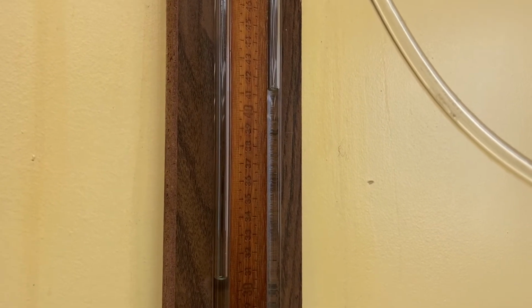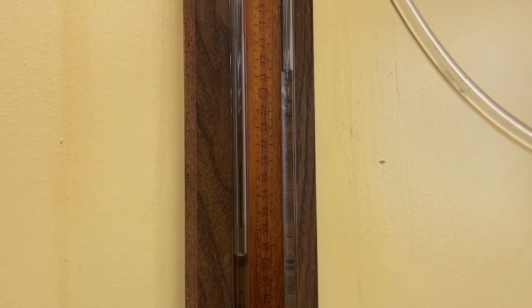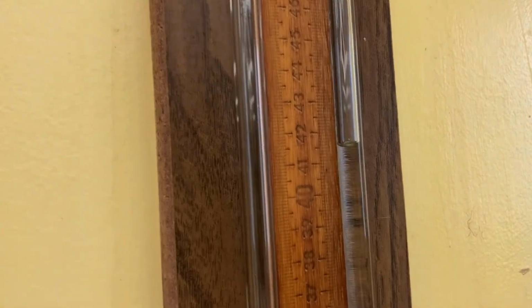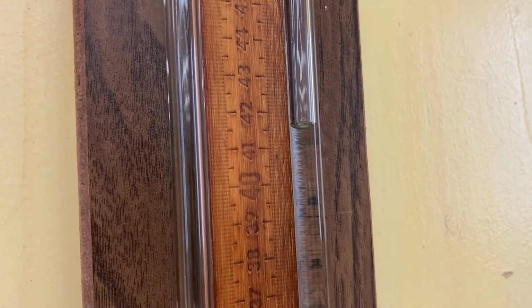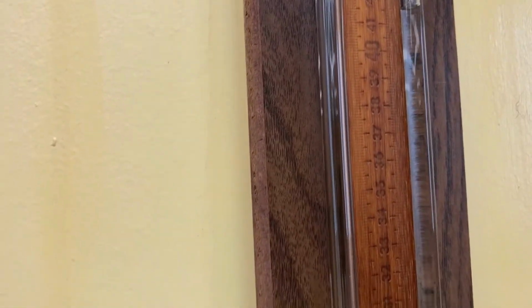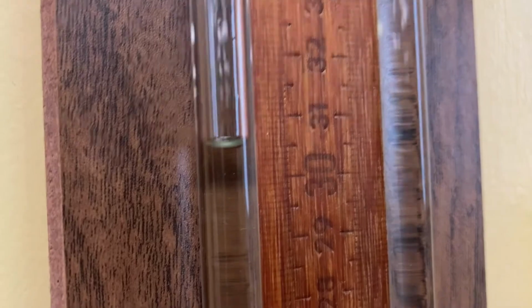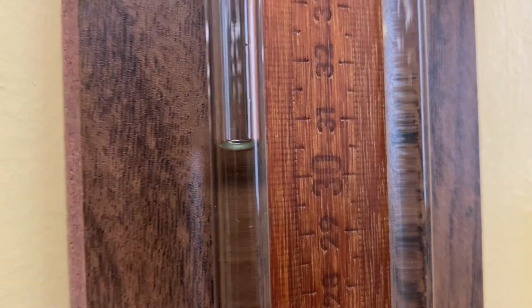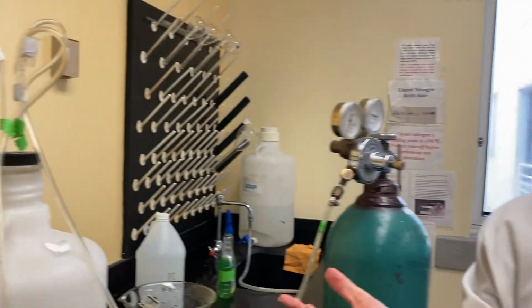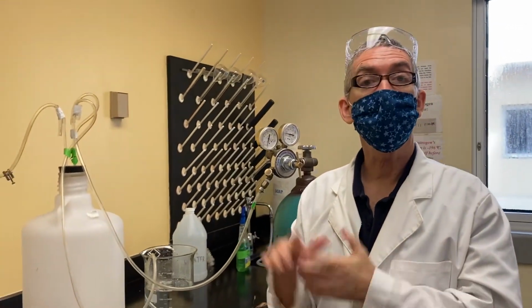Once those have stabilized, their minute's up, you simply record the heights of both meniscuses and convert the difference to the pressure by using barometric pressure. That's your P3. Okay. P2 was simply the barometric pressure. So you have now completed one run of your experiment. You're all finished with one run.